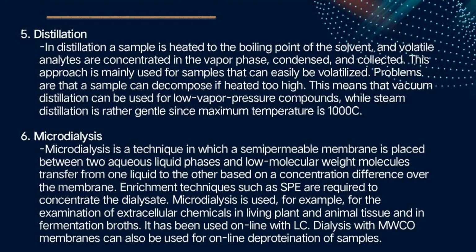Microdialysis is an in vivo bioanalytical sampling technique used to monitor the chemistry of the extracellular space of living tissues. Micro refers to the extremely small scale and dialysis refers to the movement of chemicals across a permeable membrane.